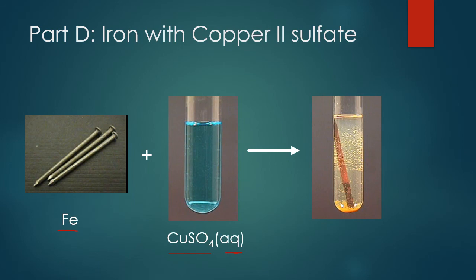And right next to it, you'll see it says after reaction. So once we add these together, notice what happens to the color of the solution, and then also notice what's happening to the iron nail. Did it change colors? Are you seeing any bubbles, anything that you see? You'll write the balanced equation for this reaction. So notice you're taking an element and reacting it with a compound. So you're probably going to see some partners switch over on the product side.